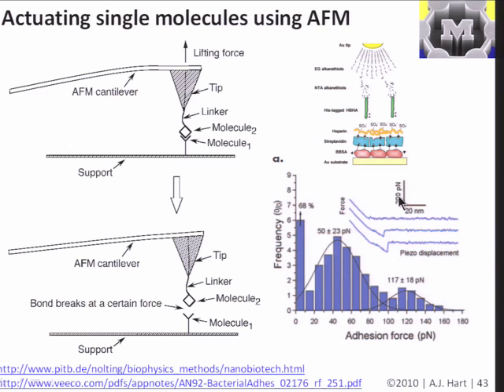And there are other examples that I'll jump over in the interest of time, but there's also, in the mechanical sense, a lot of work on, for example, measuring the mechanical properties of individual molecules by AFM, and that has relevance to biology and understanding forces involved in self-assembly as well.